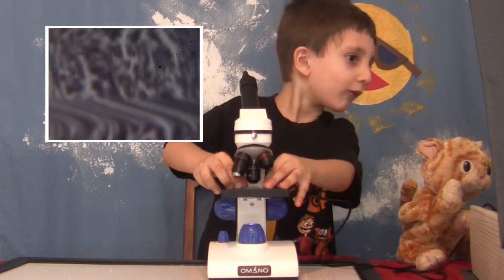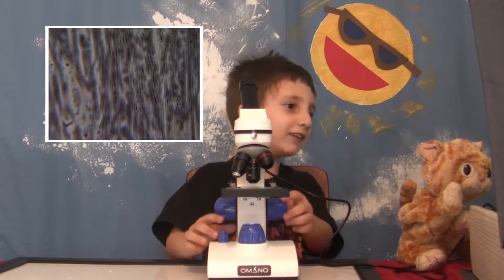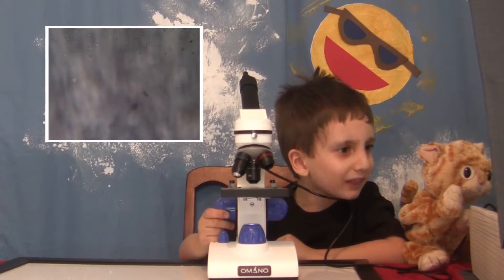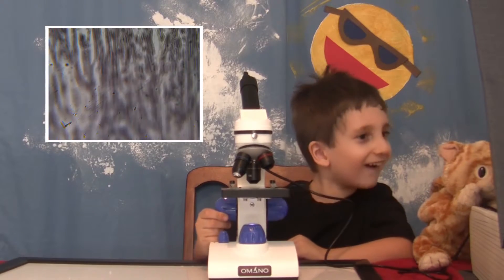Oh, I see it! There it is. Oh! Oh! There it is! Is that it? Oh! Yeah! That's not what I expected. That's what a heart muscle looks like. Well, muscles do have kind of fibers in it.